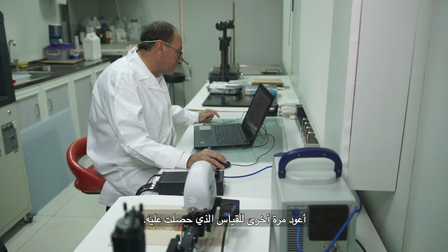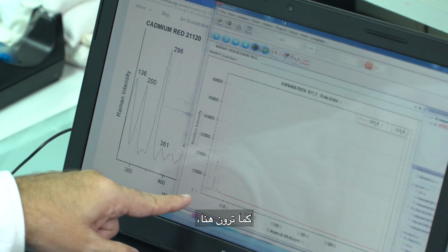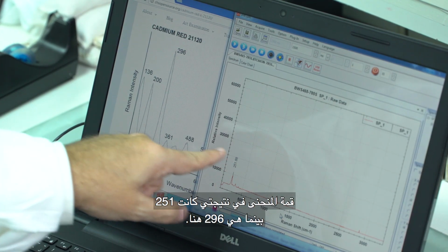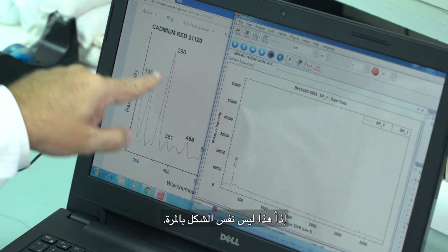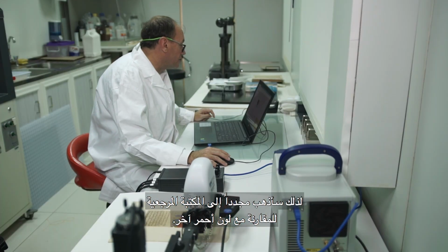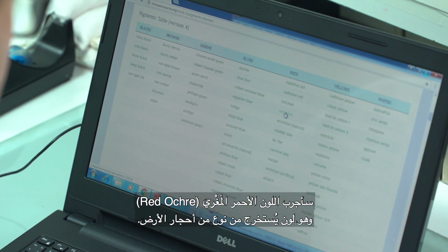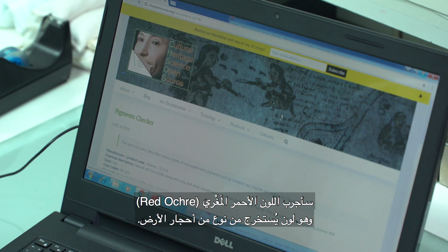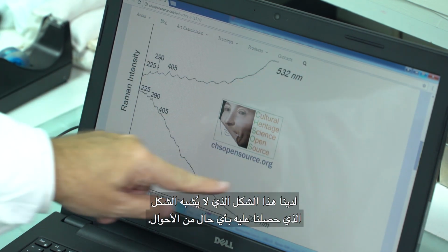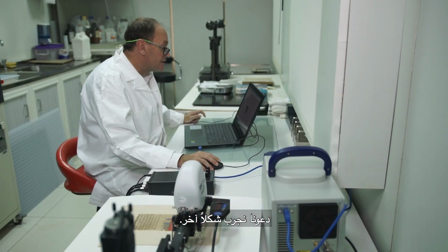So now I come back to my measurement, and as you can see, my peak level was 251 and here it's 296, so it's not the same shape at all. So it's not this red one, so I will go again and check for another red. For example, I have a red ochre. Red ochre is made from earth, and you can see the shape, which has absolutely nothing to do with the spectrum I get. So let's try another one.